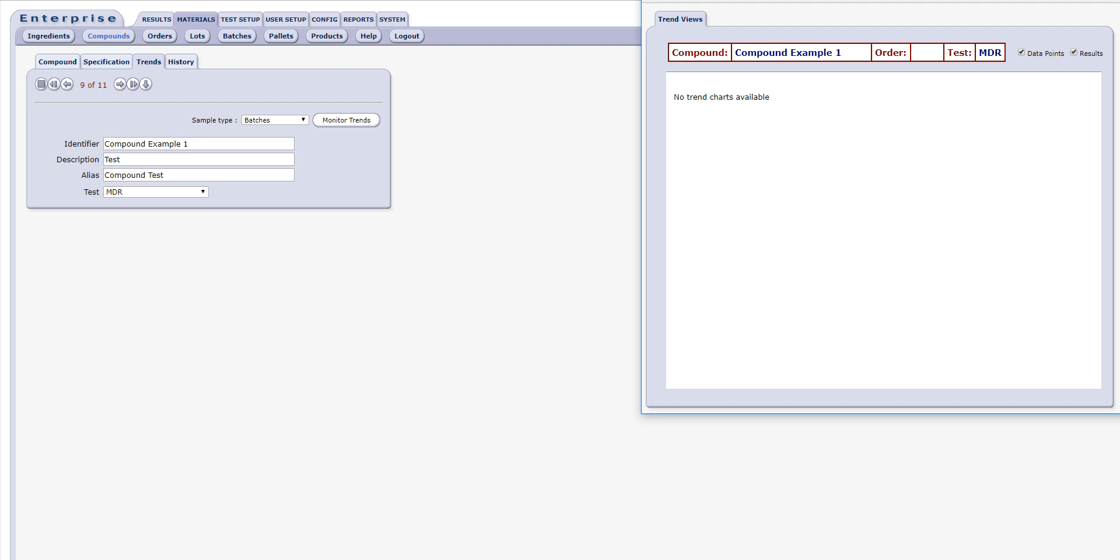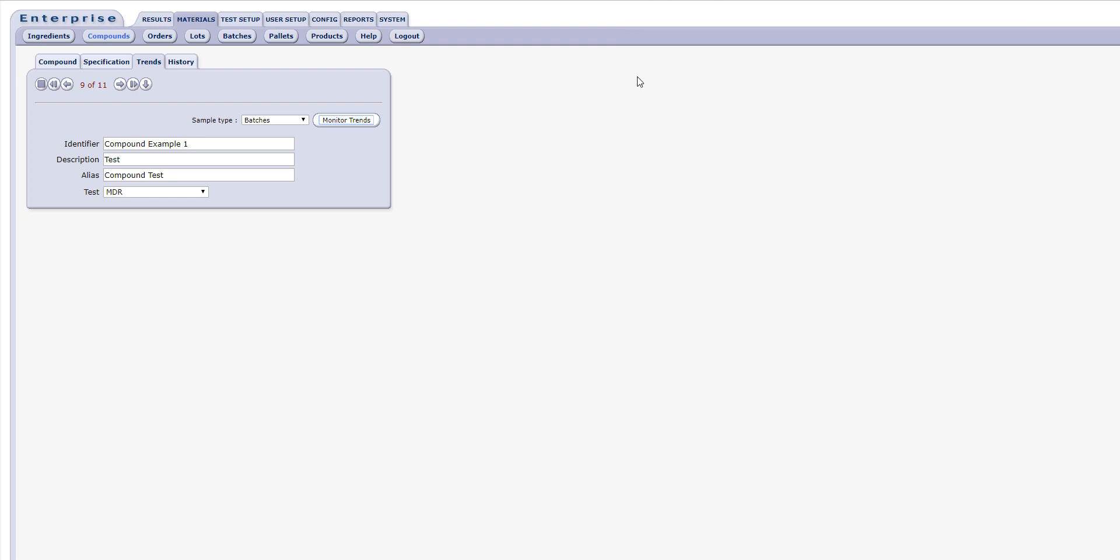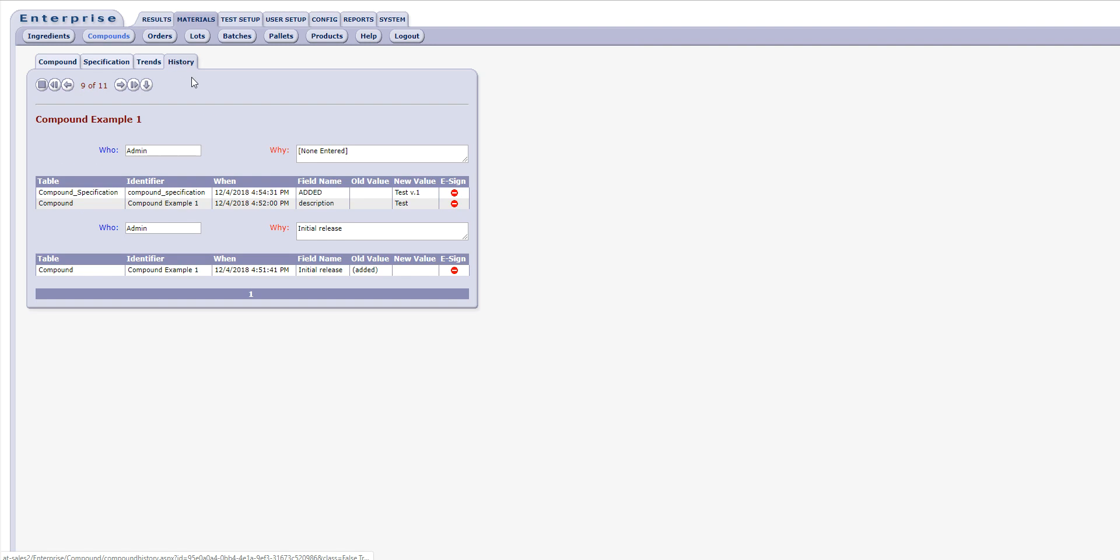The History tab is the final tab on the form. When creating a new compound, the History tab will be empty. As critical changes are made to the compound record over time, they will be logged and available on this tab for review.